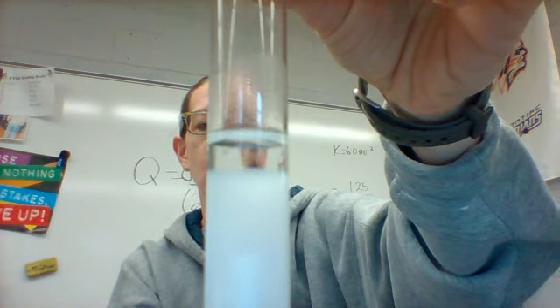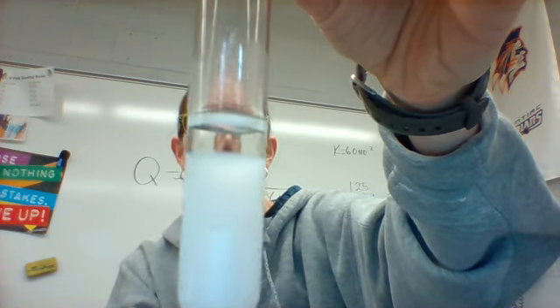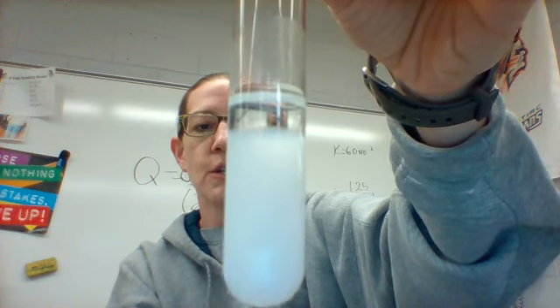I just wanted to show you those different results after they had set for a while so that you can see those reactions did produce something new.